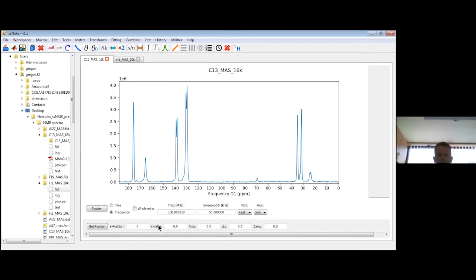Okay, I guess this is something about the first part, the usage of the Snake program. No, this is not yet all.